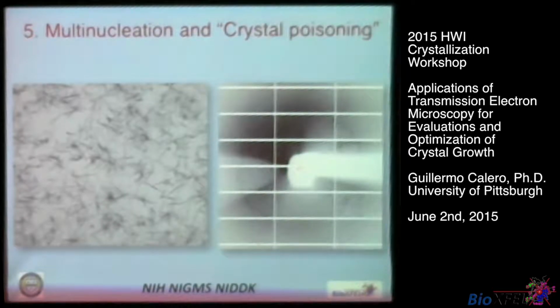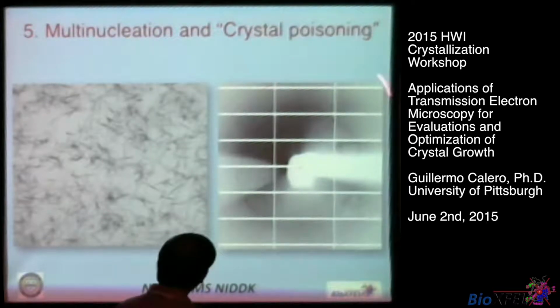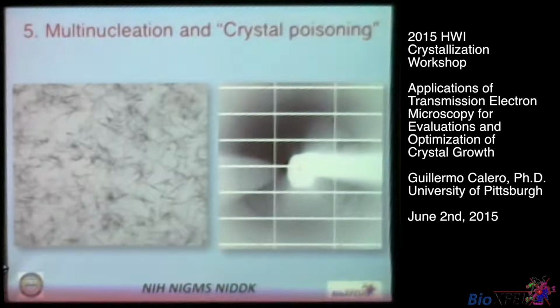We took one of these bundles to diffraction, and you can see this is a 5 angstrom pattern. There are some spots here and some spots here that you probably cannot see. Of course, it's not a single crystal, but this indicated that the lattice was probably well ordered.